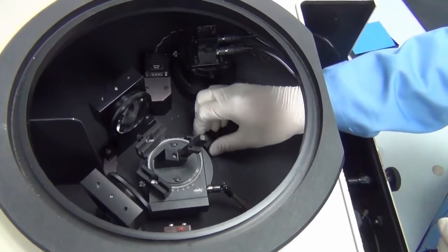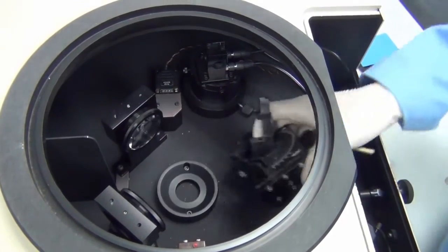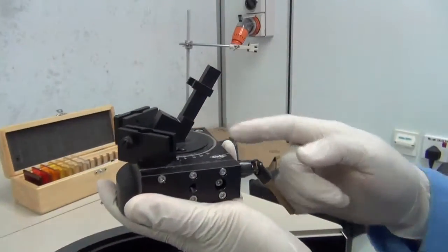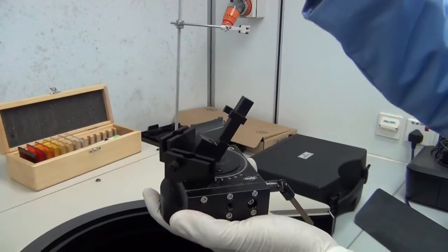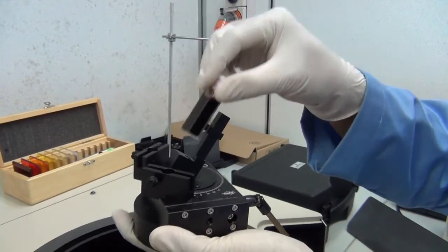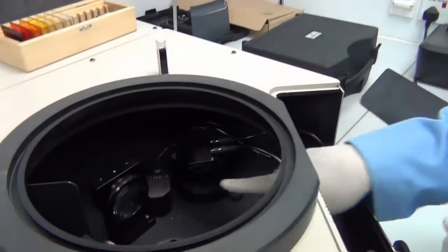Just simply unscrew the stage. This is not the stage. This is not the stage for liquid. This is definitely wrong. Not this orientation. The liquid sample should be slotted in vertically. This is already slanted around 45 degrees. So this is not the stage. The stage will be right over here.